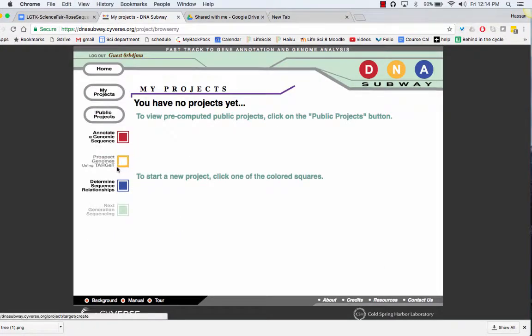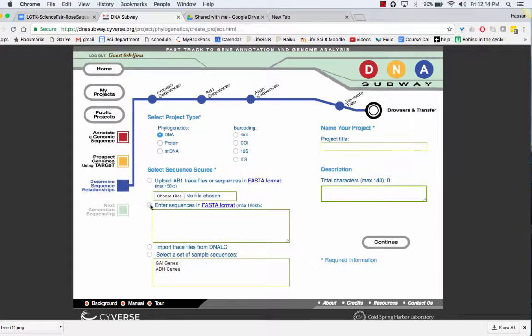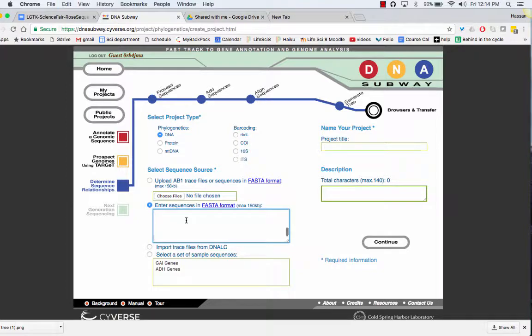Then you're going to click on the blue button. Click on DNA. Enter sequences in FASTA format. So you're going to paste those sequences.